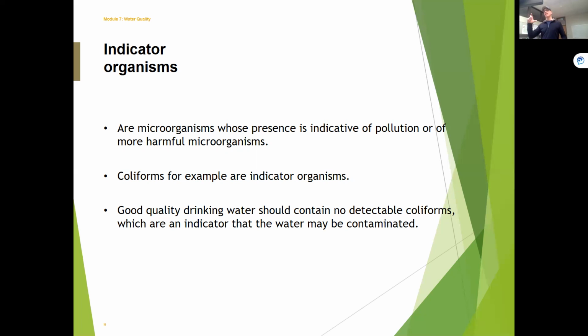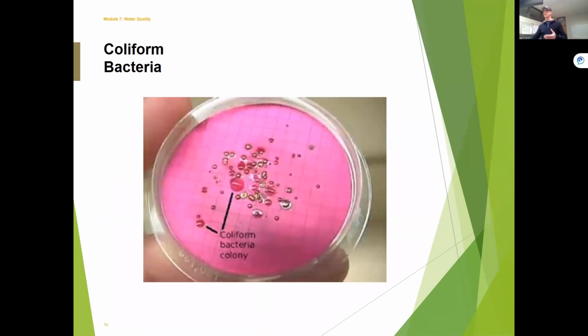So when I do a sample, usually it's a 100 ml sample, and I'll fill that up. It has a chlorine deactivator in it, and we'll put the water in there. And sometimes in some methods, they'll put the bug food or the media inside the vial. And other times what they'll do is they'll pour that sample into something called an agar plate. And that's this picture here.